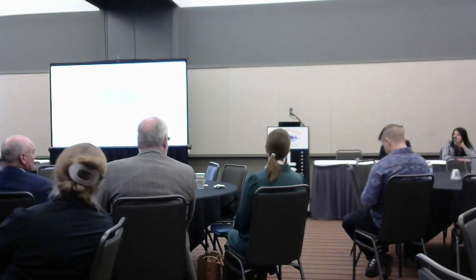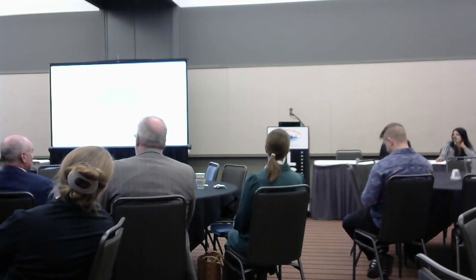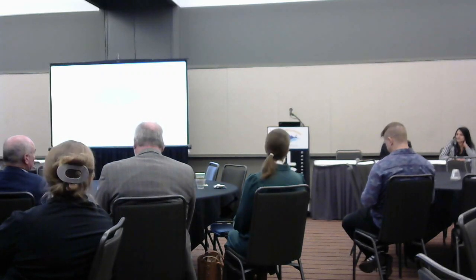Currently, we haven't done any conversions, but that's the next thing on the Lightsheet pipeline that we have to do, an OME-ZARR conversion. But we haven't done that yet. Okay, I was just curious if you had any experience, but it sounds like that's in the works.